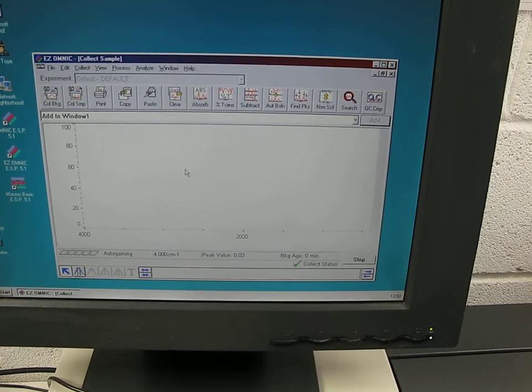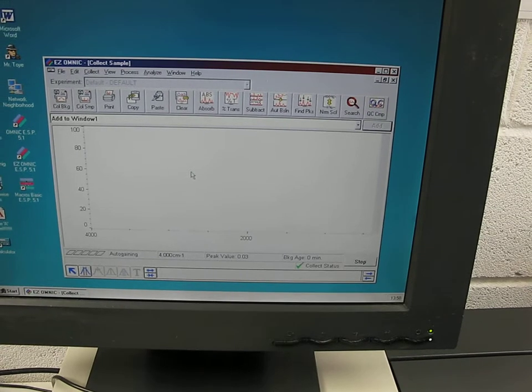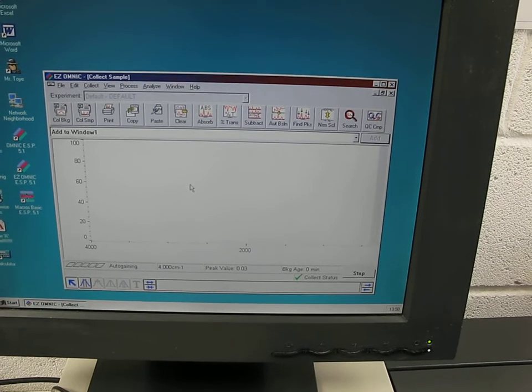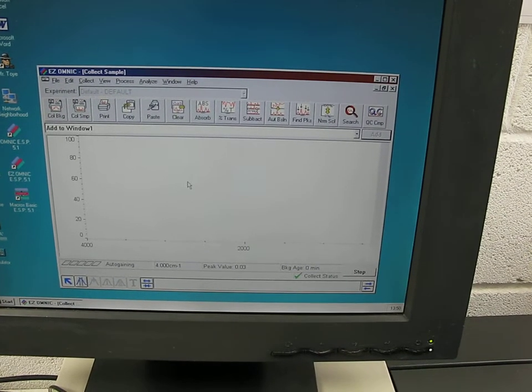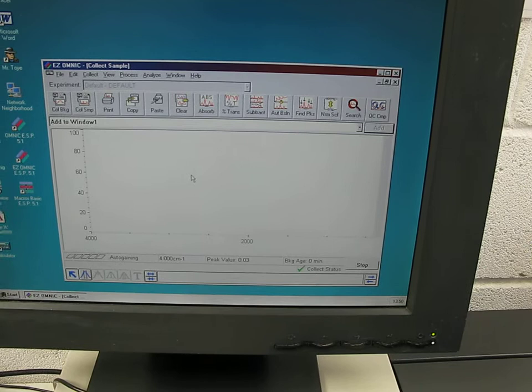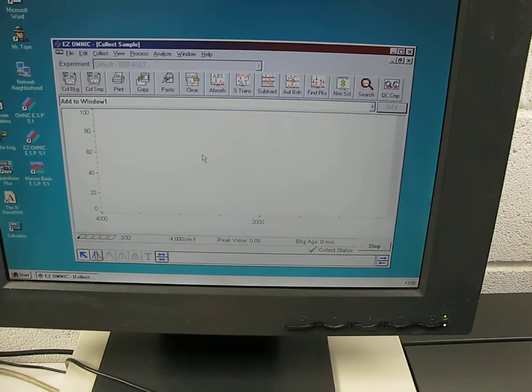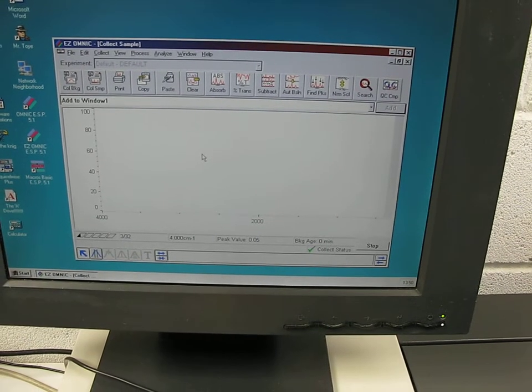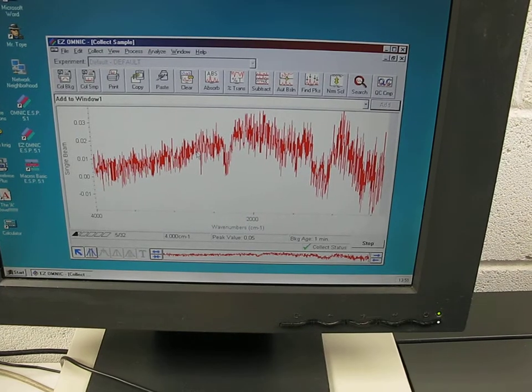So we're just looking at this now, waiting for the sample to come in, and just waiting for that now, get it started now, here we go.